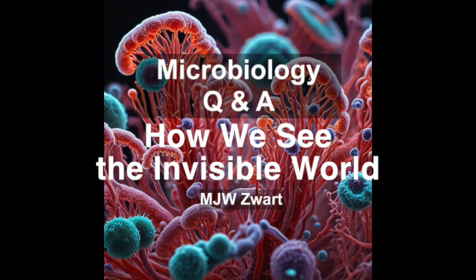But before we go further down this rabbit hole, let's pause for a second and talk about how we actually prepare samples for microscopy. All right. I vaguely remember staining things in high school biology class. Is that still a thing? Absolutely. Staining techniques are just as crucial today as they were centuries ago. They're essential for enhancing contrast and making specific structures visible under a microscope.